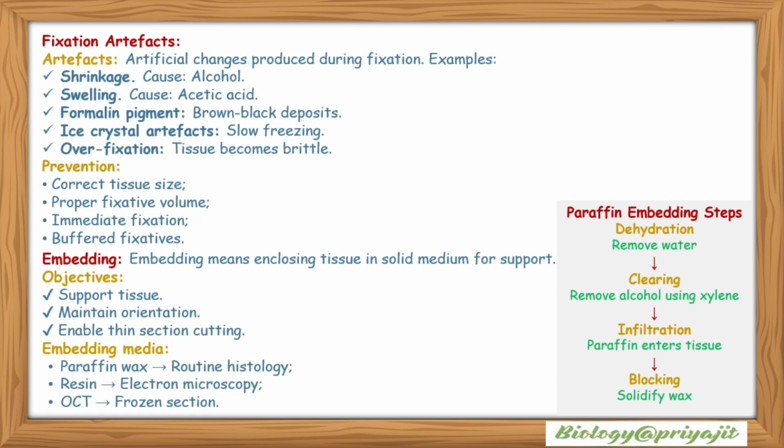Embedding means enclosing tissue in a solid medium for support. Objectives: it supports tissue, it maintains tissue orientation, and it enables thin section cutting. Embedding media: paraffin wax is used in routine histology. Resin is used in electron microscopy, and OCT is used for frozen sectioning.